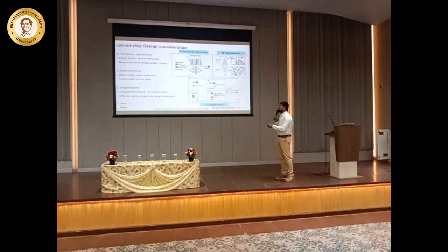But there are a few instances where you need to go for segmented flow and droplet flow based methods, because with the droplet flow based method you can create droplets here. So can you see here? These droplets are going to be your beaker. Don't consider it as a droplet, consider it a beaker. The only thing is it is going to travel in a channel, a micron channel, right? So rather than having bulky instruments with a 100 ml beaker and stirring it, I make everything into micro droplets, and now I can also control the amount of reagents that I need to make that droplet in the channel.